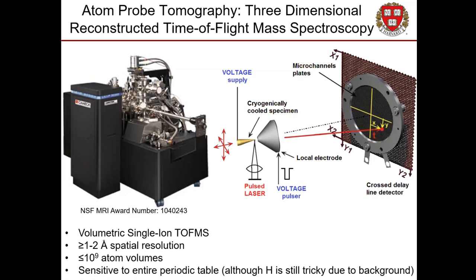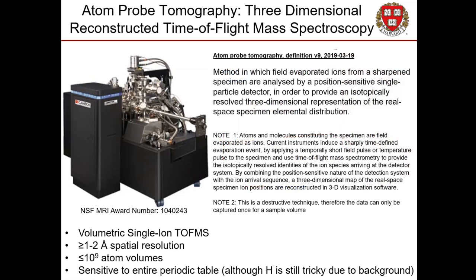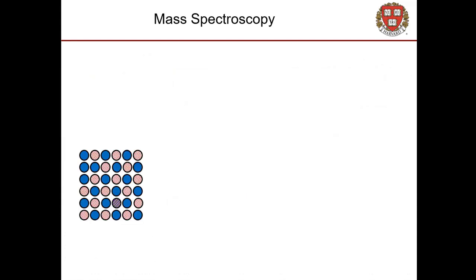I'm just going to flash up briefly the current official definition, and I'm not going to dwell on it. You can look at the VOD if you want to read through this, but the point is just to indicate that Atom Probe is also an evolving technique. It is a technique that is improving and being worked on. Part of that, of course, is developing standards and terminology, which is also under development.